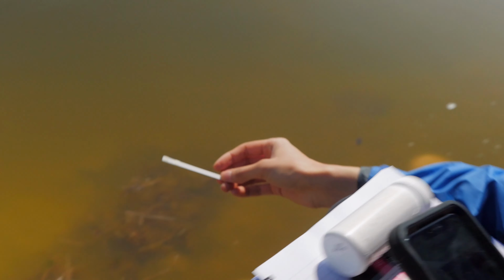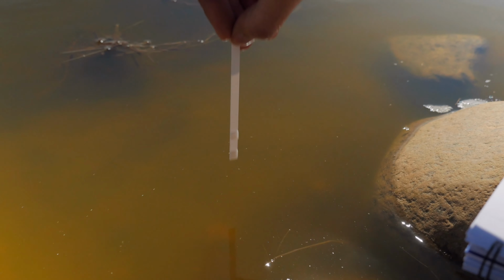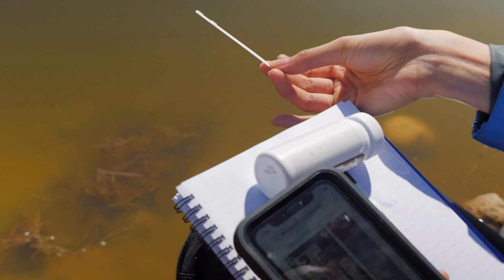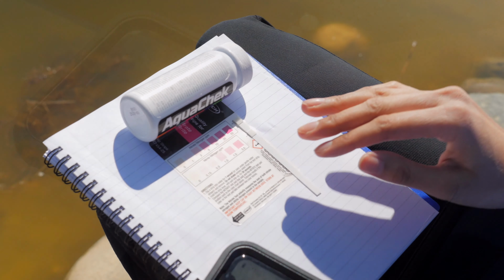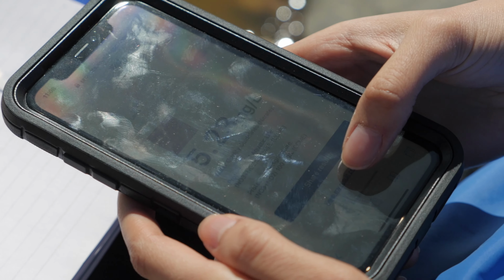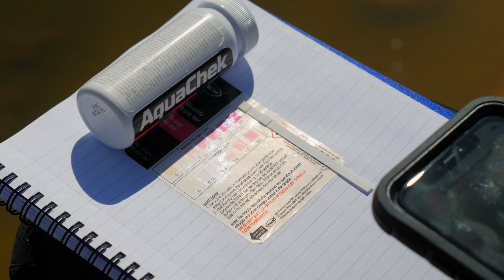To measure nitrate, all you need to do is dip one test strip into the water that you wish to examine. Then, take an image with the Nutrient app of the test strip against the reference sticker located on the back of the bottle.